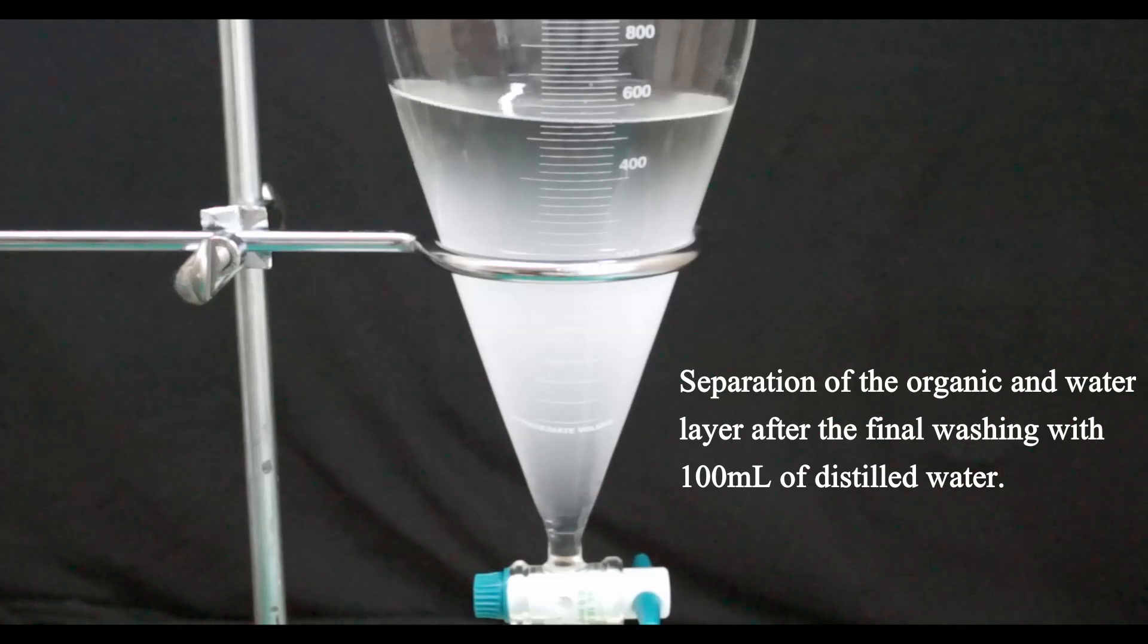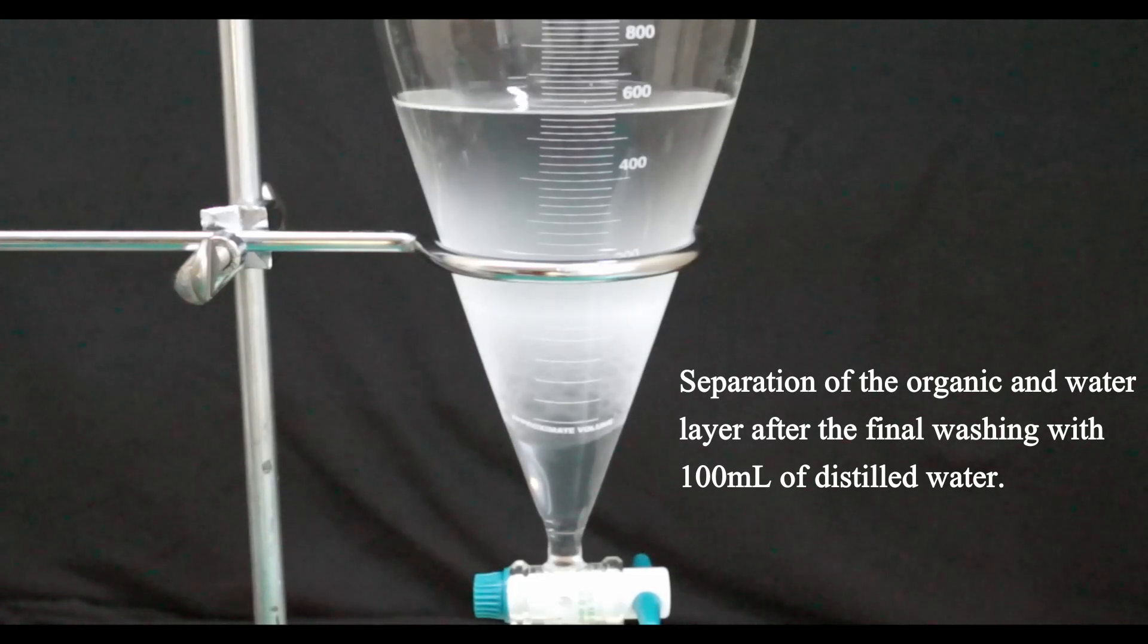The final washing is done with 100 milliliters of distilled water and as you can see in the video the phase separation after vigorous shaking is very fast. During all the washings there was no problems with emulsion formation and every time I got a quick phase separation as the one you see now.